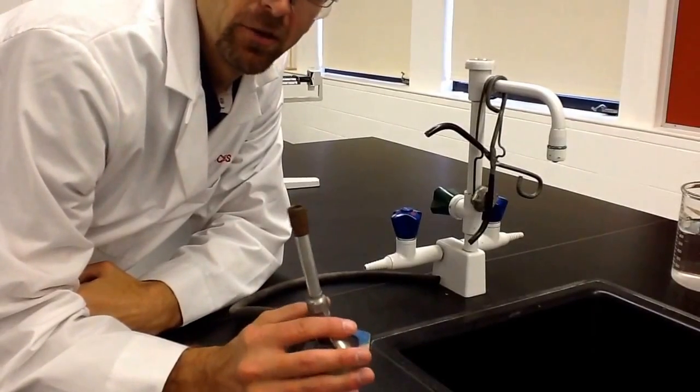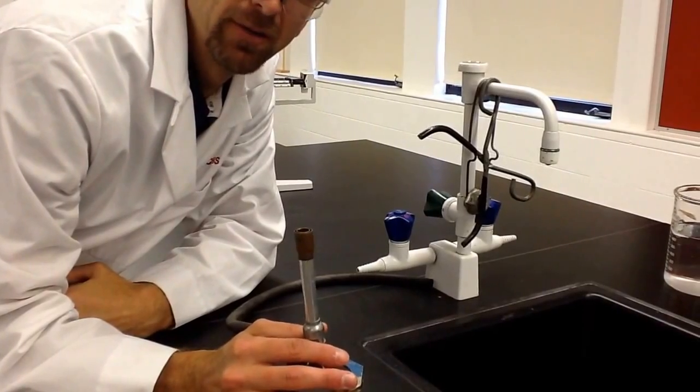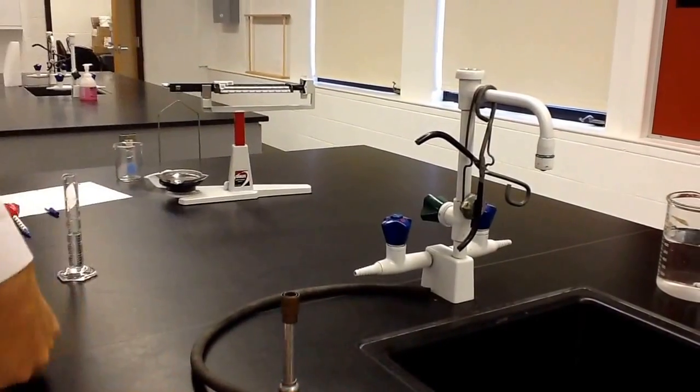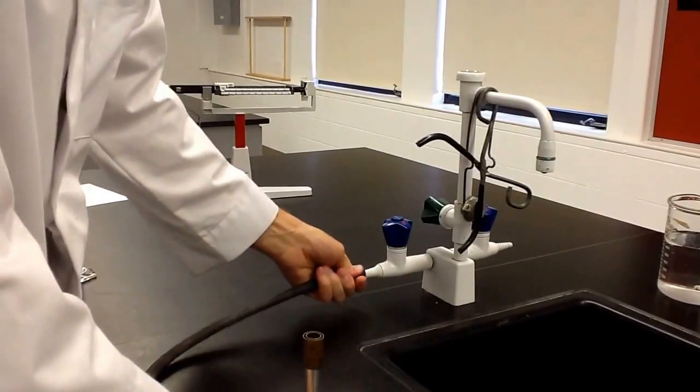This is a burner — this is a Tirrill burner — and we'll be using this quite often in class. I'm going to show you how to use it, how to light it, and how we take care of it in class. First of all, you have to hook the hose up to the gas valve.